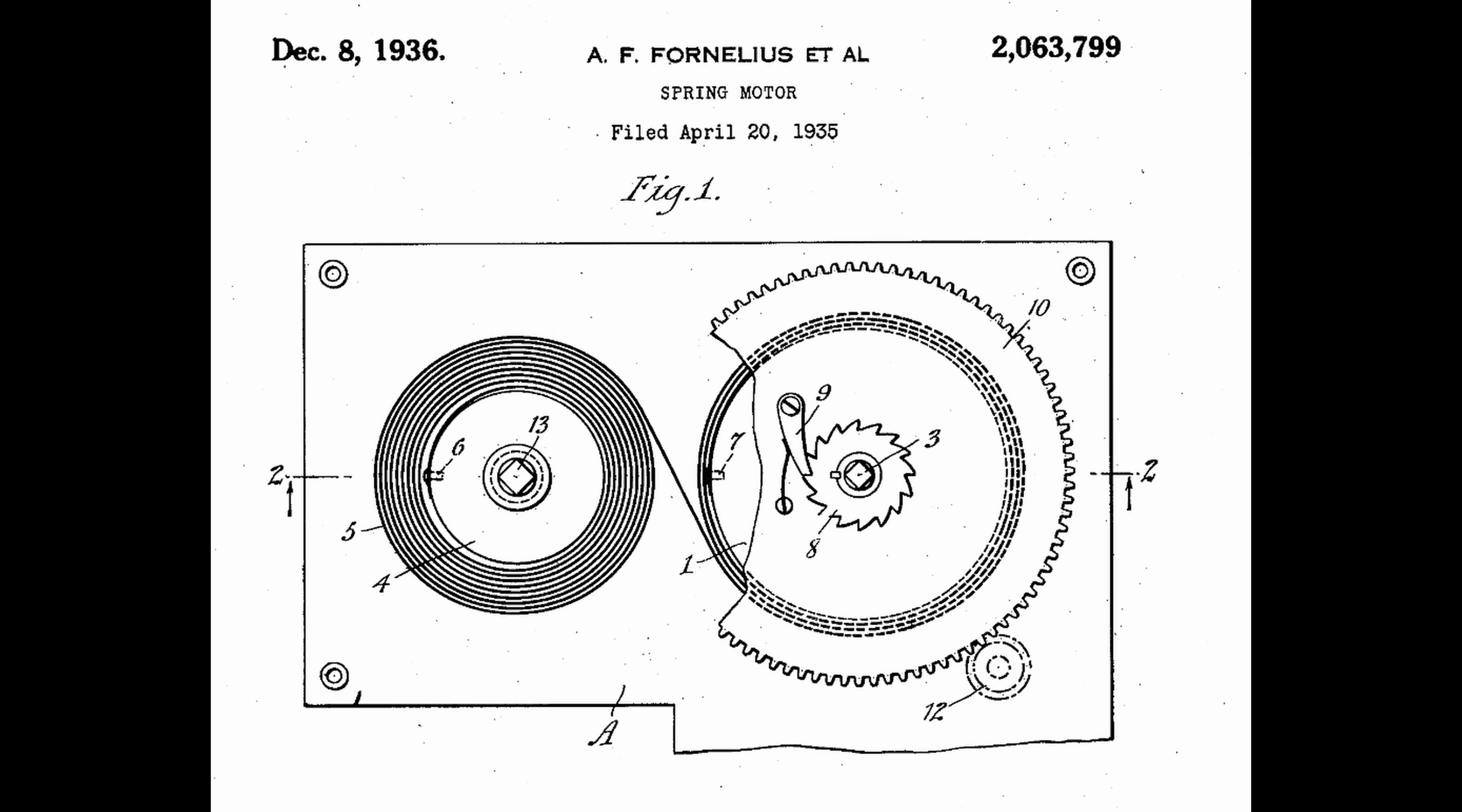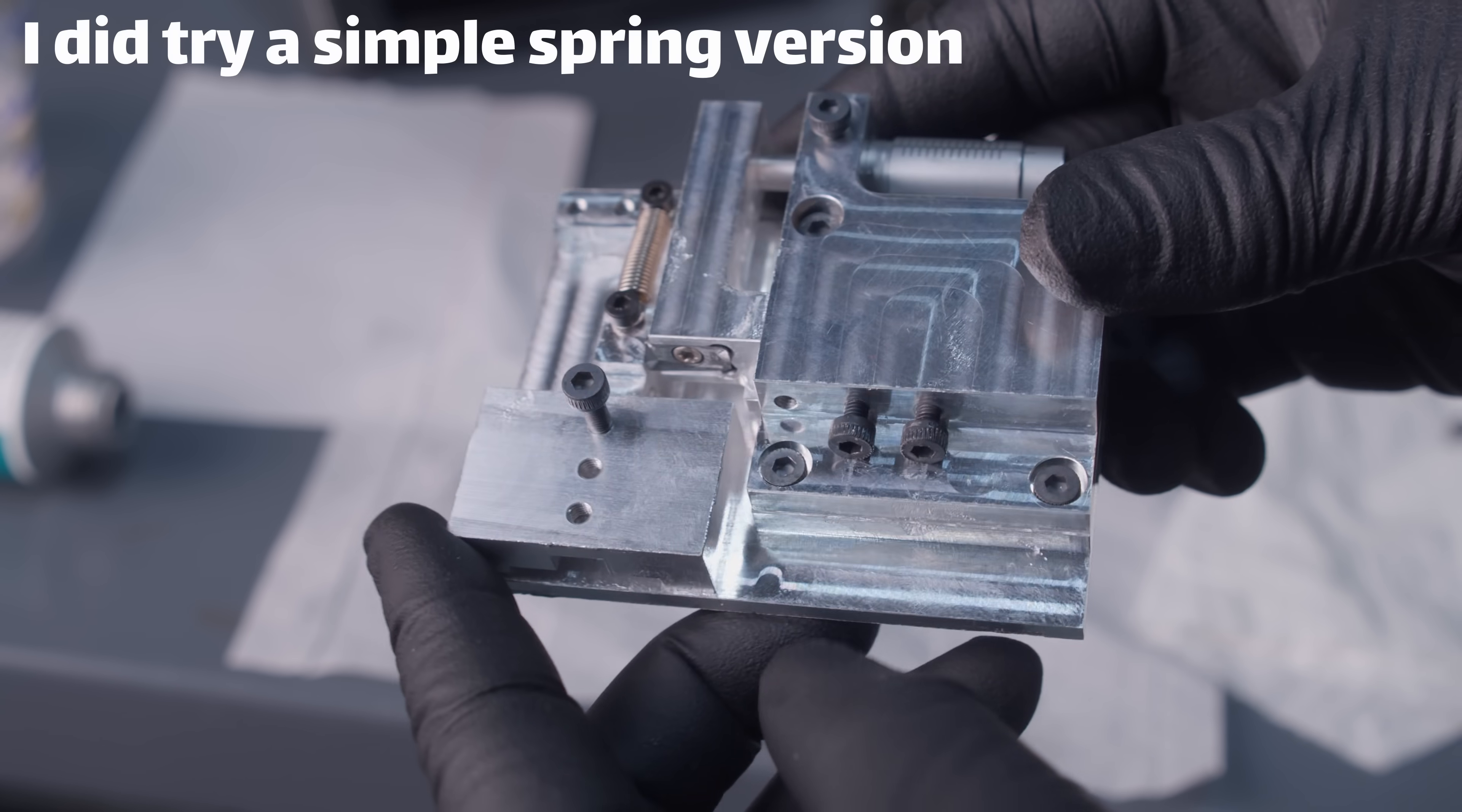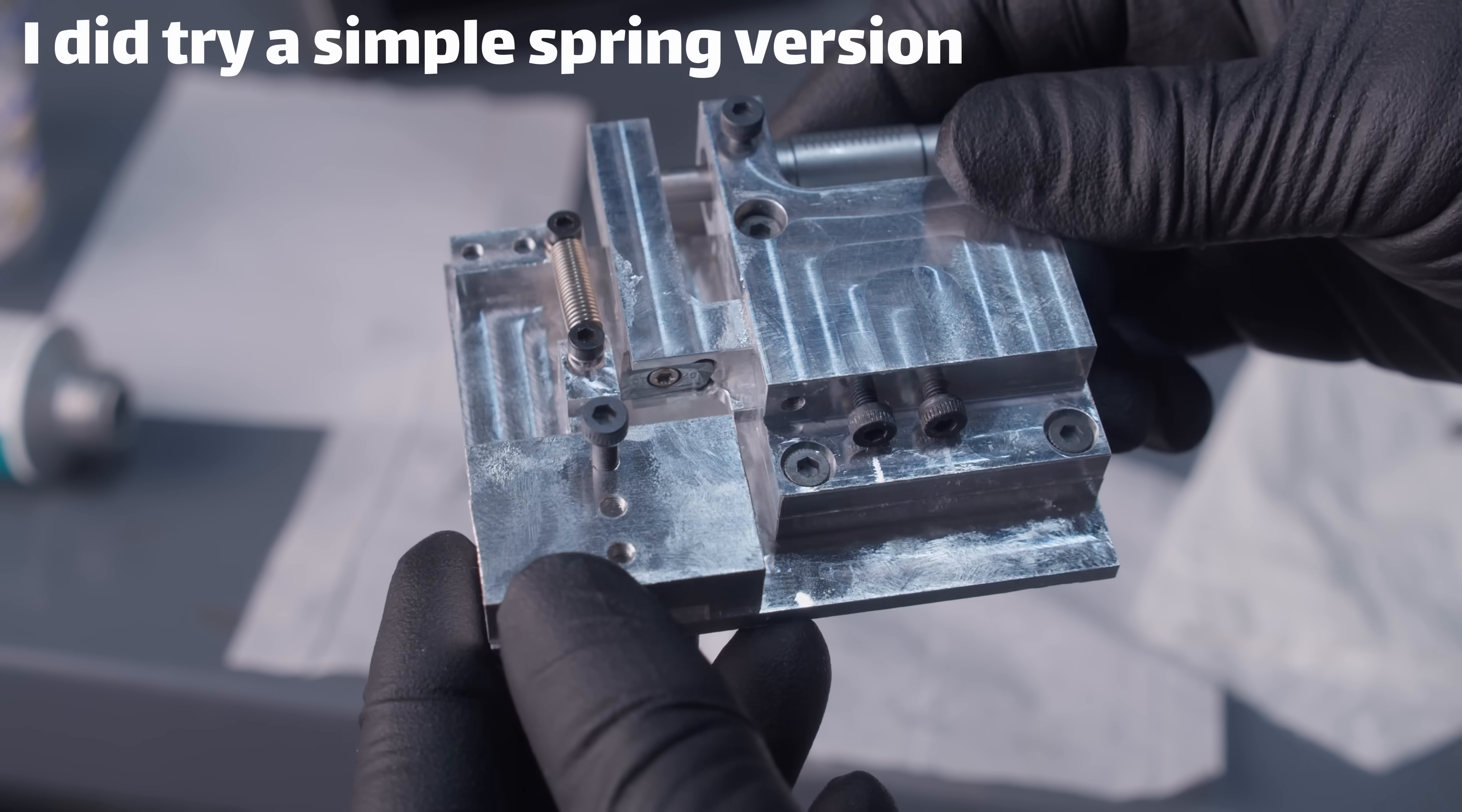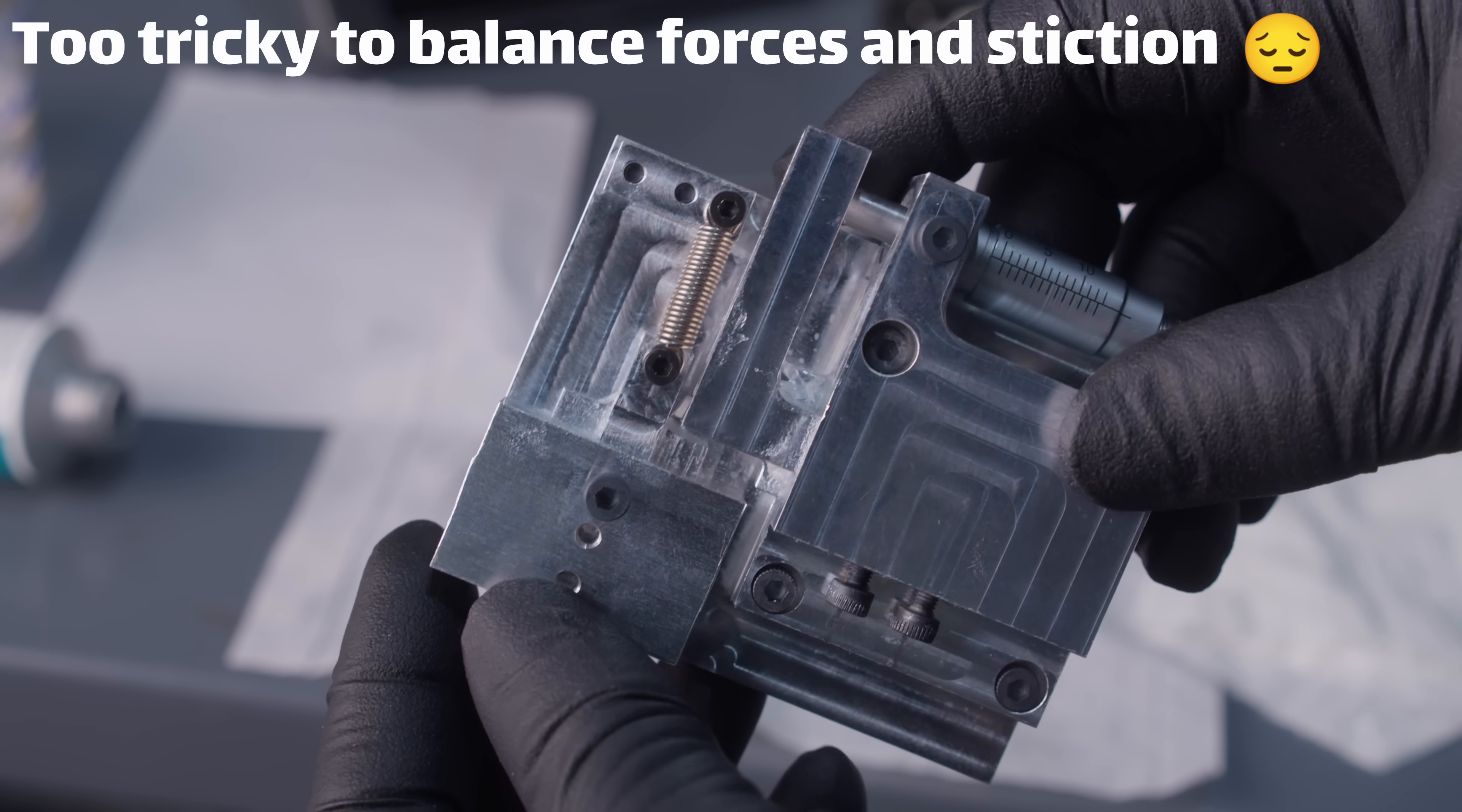But otherwise, I think what I might do is make some sort of mechanical clockwork wind-up mechanism and use that to drive the cutter forward. So the idea would be you would wind it up ahead of time, put it inside the chamber, and then start imaging really quickly. And it just will cut as long as that clockwork spring is giving it energy. That would take a pretty significant amount of CAD work on my side, so I think I'm going to bump that to the future.